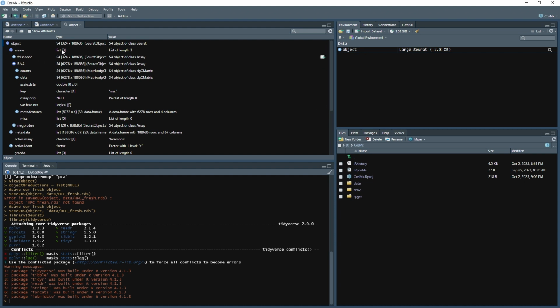If the false positive probes, negative probes, and the false codes are in the data, they're not truly biologically part of the cells, right? So if there's more false codes, that's not going to help us identify whatever brain cells are there.